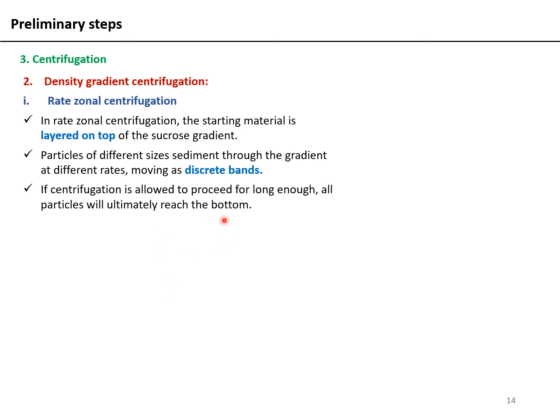If centrifugation is allowed to proceed for long enough, all of the particles will eventually reach the bottom. So in rate zonal centrifugation, the duration of centrifugation plays a very important role.